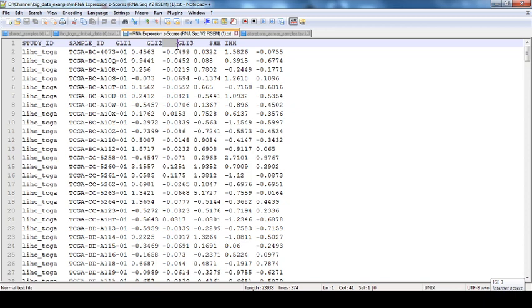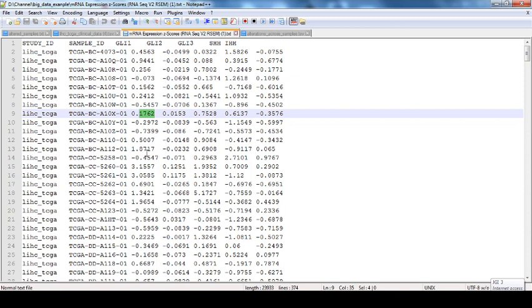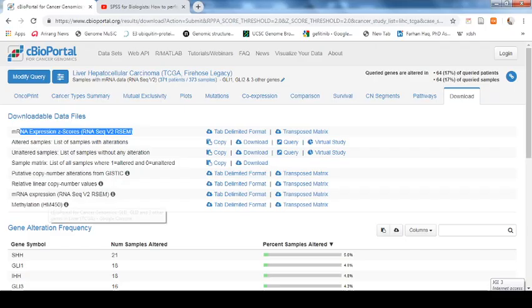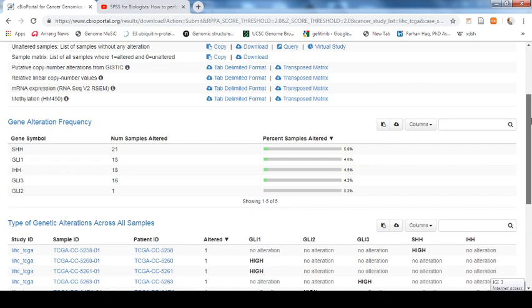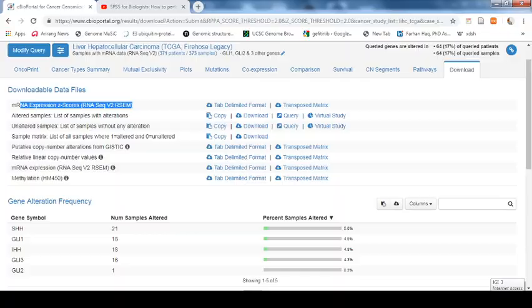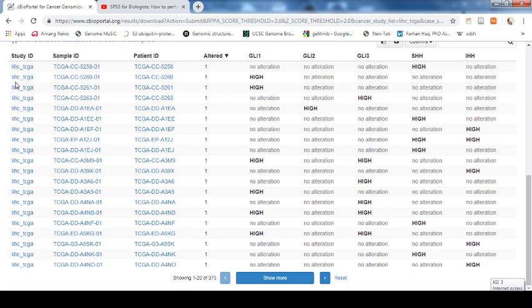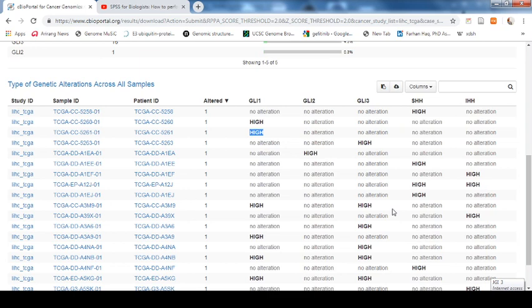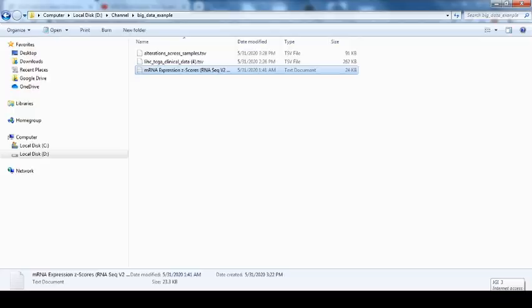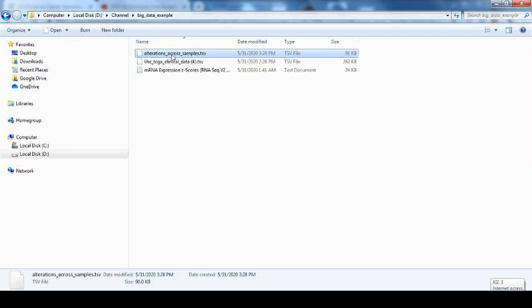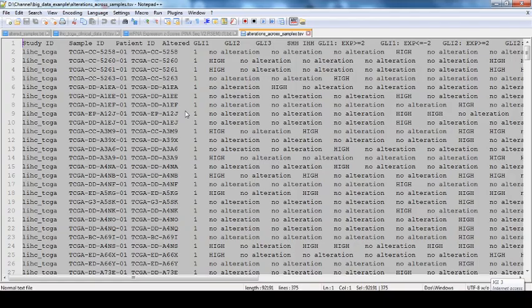Information of Gli1, Gli2, Gli3, SHH, and IHH — these are the expression values, the Z-score expression values. What is the Z-score and what are log R values or the expression values is beyond the scope of this study, but here you can see that these are just expression values. Now if you want to find the association with different clinical features, you can download this information. But if you want the absolute values to calculate — for example, this gene showed high expression — based on the log R values they have estimated that this sample showed high expression of Gli1.